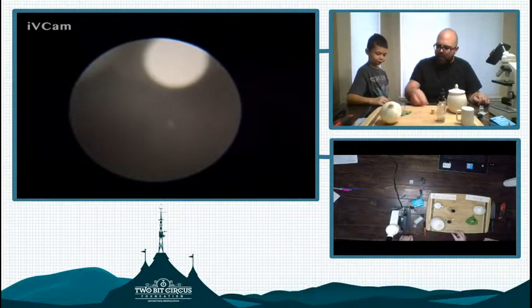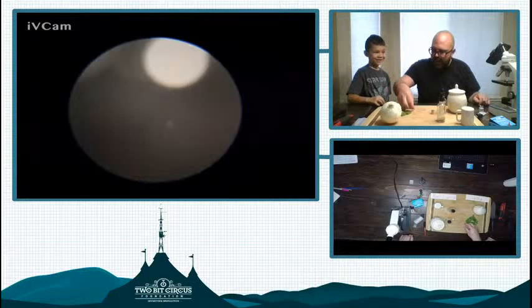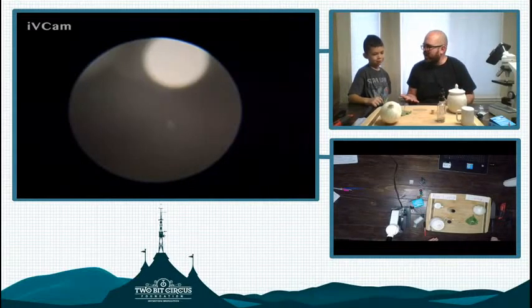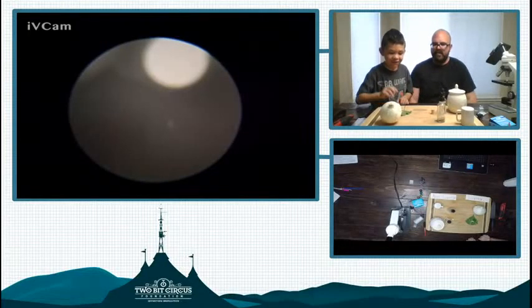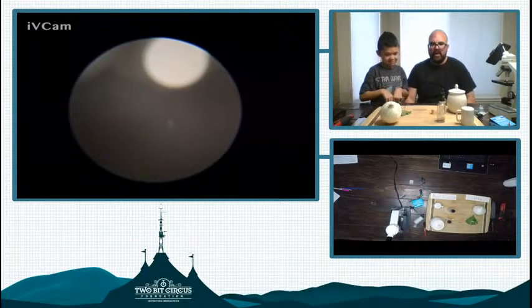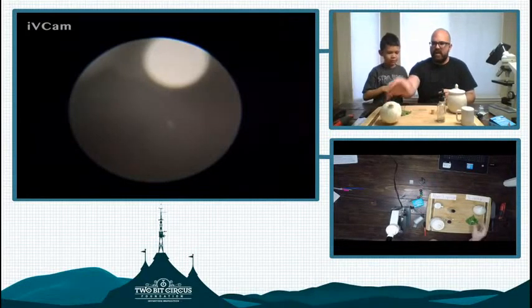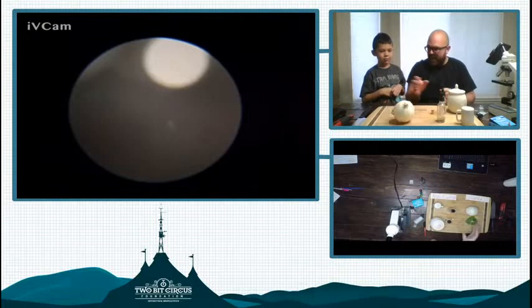We're gonna let Robert prepare slides, because he's learning how to do that, right? How to get the slides ready to go. And then of course I will help him. We can start with whatever object on the table Robert wants to start with. I want to start with the onion. Okay, cool. You want to start with the onion. So do you want help cutting that onion? Because I don't think that onion's going to fit on the slide like that, do you?